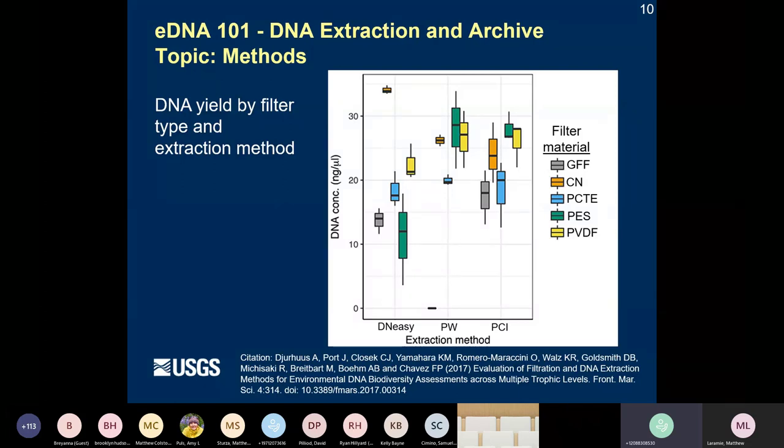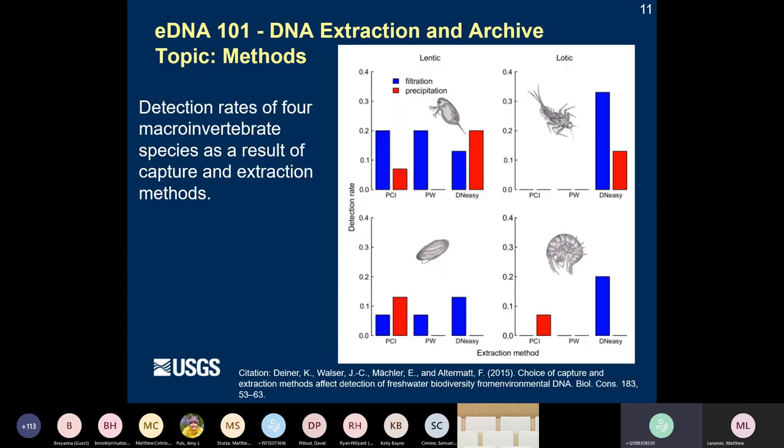But the glass fiber filters are in use all over the place in eDNA, and with other combinations, they perform very well. So these aren't the only aspects to consider when you're choosing your methods.